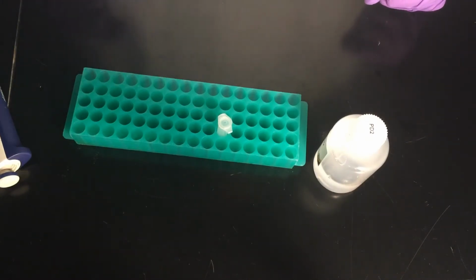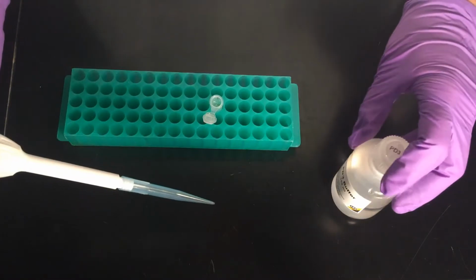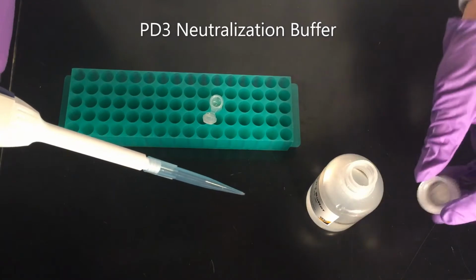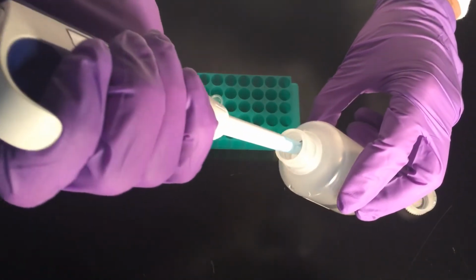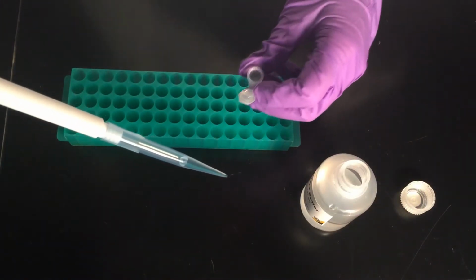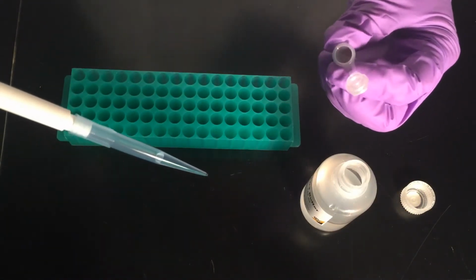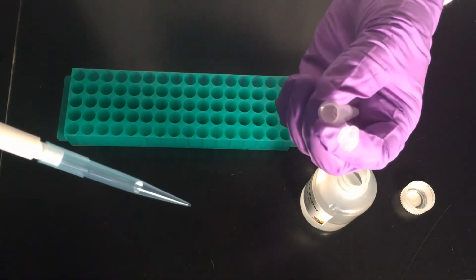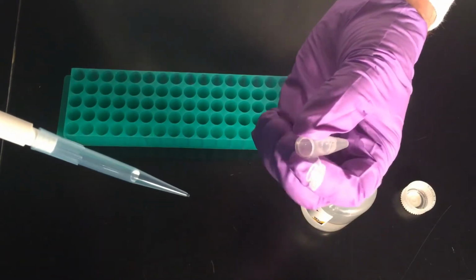The plasmid DNA is supercoiled, so it's not going to be affected as harshly and should stay in solution at this time. I leave this and let it sit and lyse the cells and denature the proteins and genomic DNA for 5 minutes. So what I'm going to do now is add the PD3 buffer. The PD3 buffer is an acidic sodium acetate solution. What that is going to do is neutralize the sodium hydroxide from the previous solution, and then that's going to allow the DNA to form new hydrogen bonds, but this time it's going to be all tangled and insoluble. But the plasmid, like I said, will remain soluble because of its supercoiling.